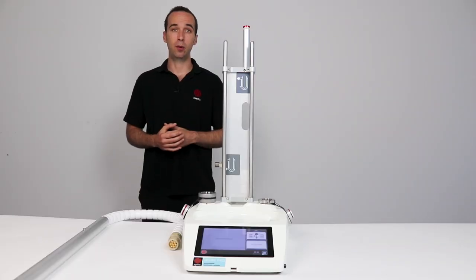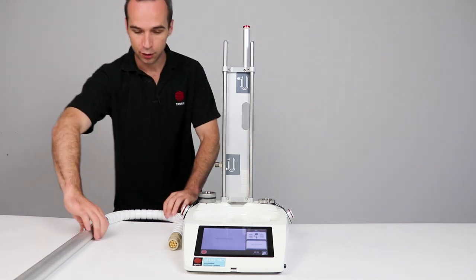Next up is the scorpion pole which acts as a system support and motor mount and clicks firmly into place.